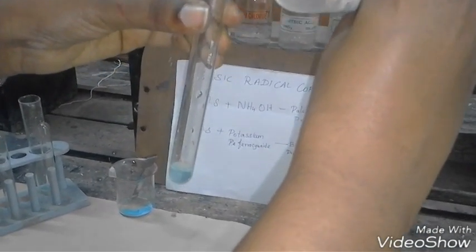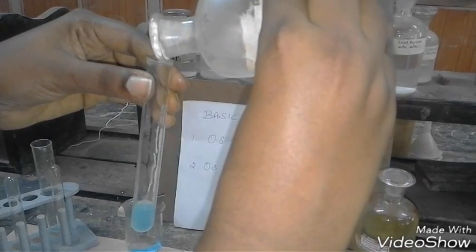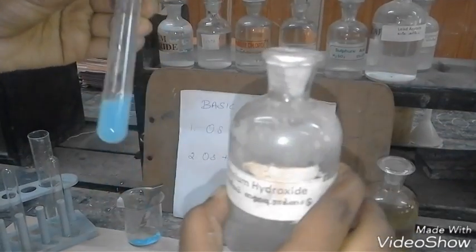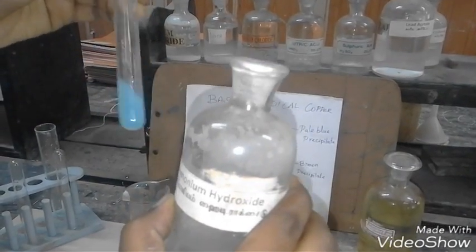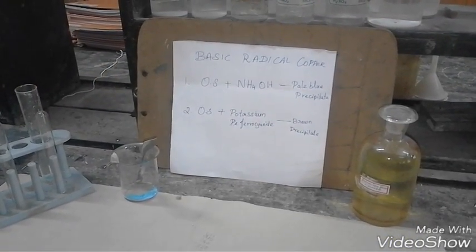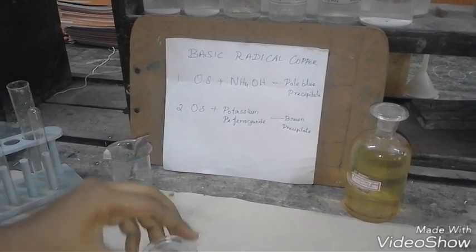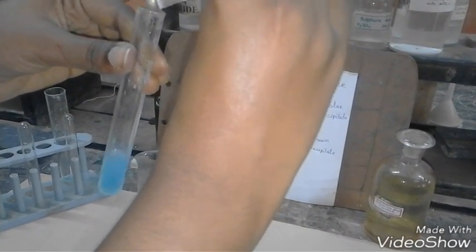ammonium hydroxide is added drop by drop till the solution gives a pale blue precipitate. If the ammonium hydroxide is contaminated, the pale blue precipitate will not form fast. Take fresh, non-contaminated ammonium hydroxide.